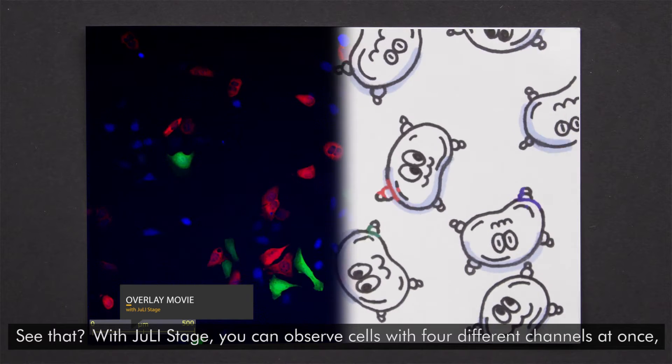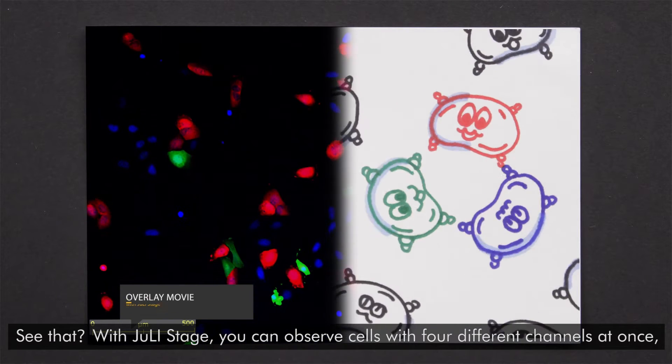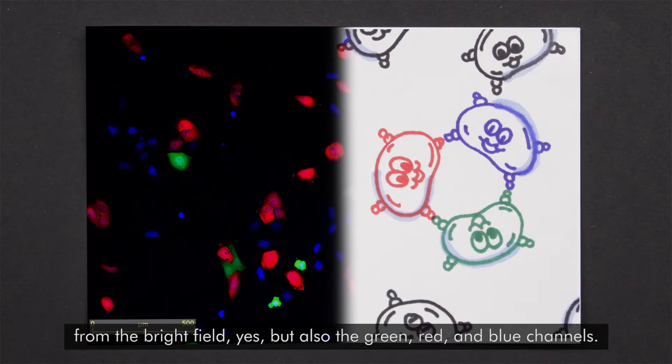With JuLI Stage, you can observe cells with four different channels at once — from the bright field, but also the green, red and blue channels.